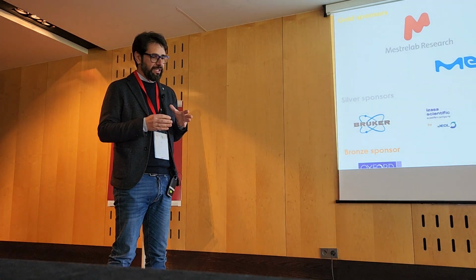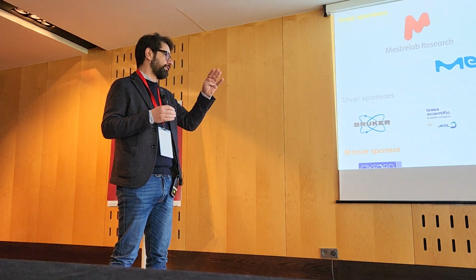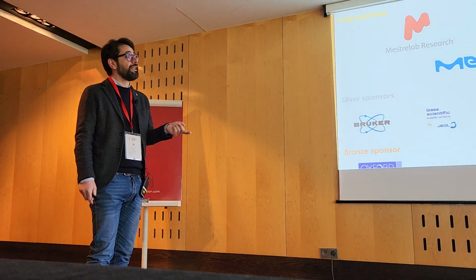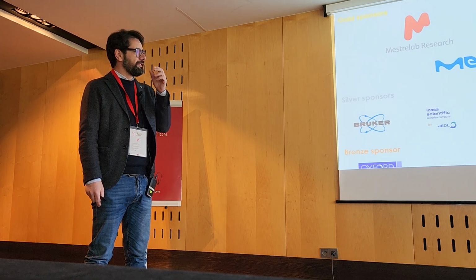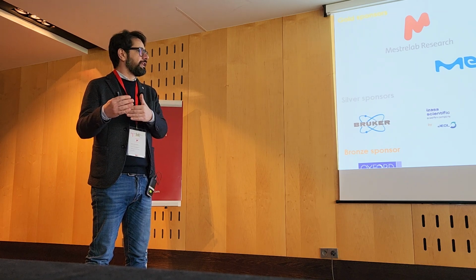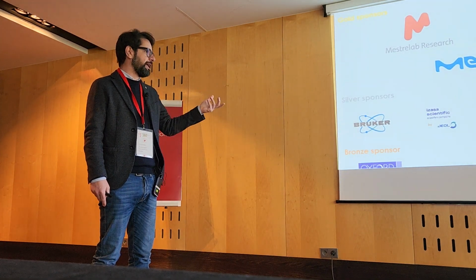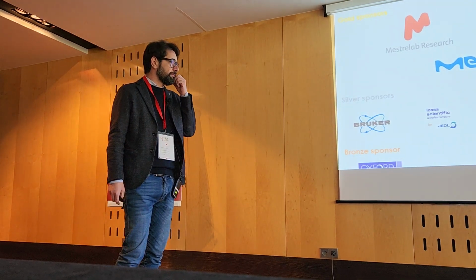But we have seen differences in the software performance. That's why we will use 4 different software, just to have a look at what happens when changing the software and also the algorithm for integration, because we have seen that MNova, which offers the opportunity to integrate in different ways, gives different results. We are very low in the error. It's not important in the error budget, but there are some effects, and we need to know these effects.